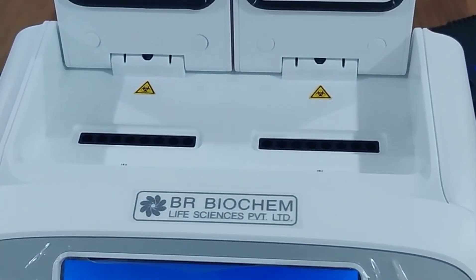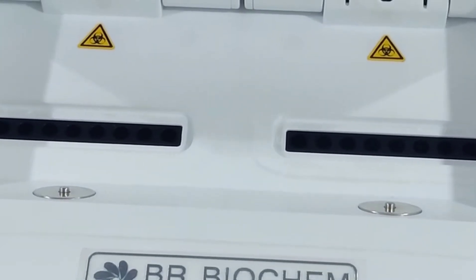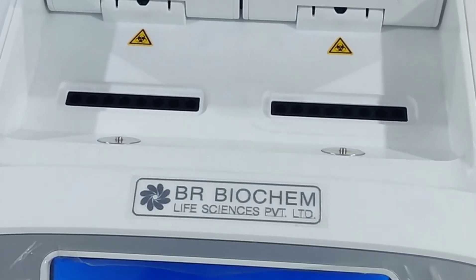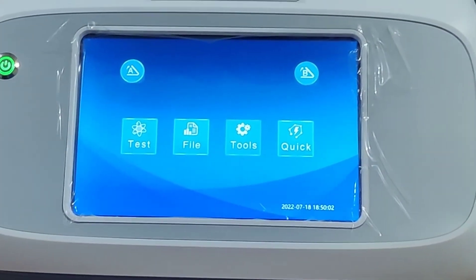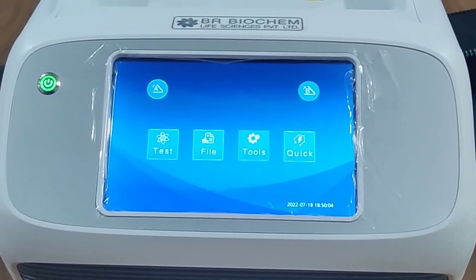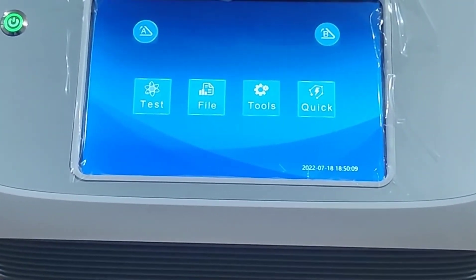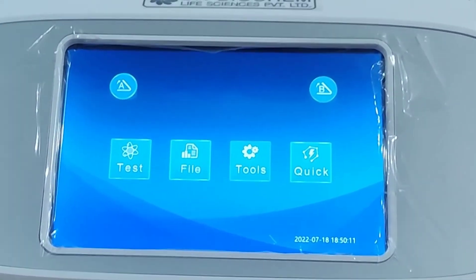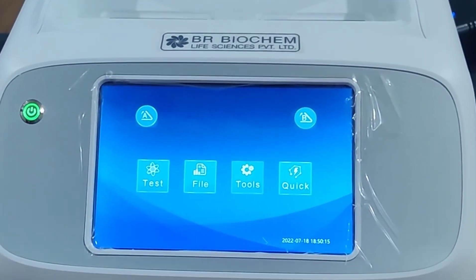You can insert 16 tubes of 0.2 ml, and you can also insert 8 strips of 0.2 ml PCR tubes. For more details, kindly visit our website www.brbls.com, drop a mail to info@brbls.com, or contact us on the numbers given below. Thank you so much.